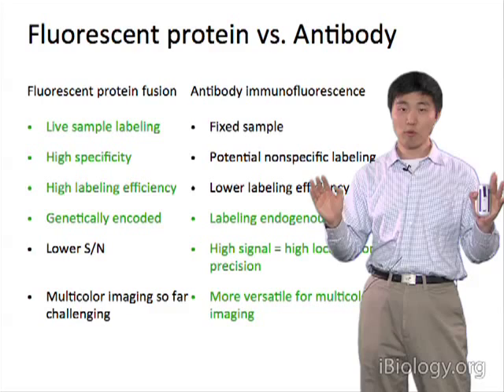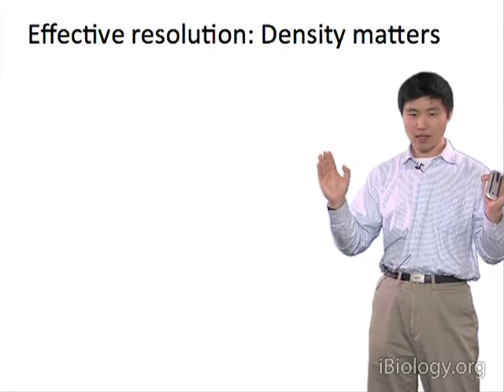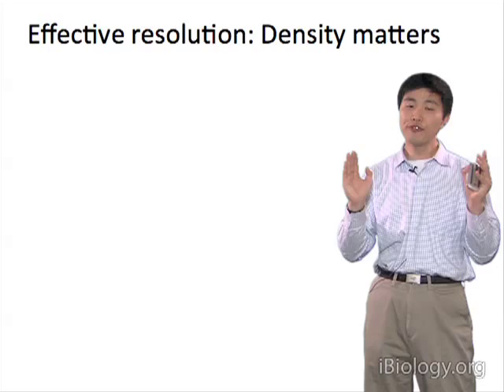Here we talked about one limitation of the effective resolution, the probe. There is another limitation. Here, we collected our microtubule images for a total of 40,000 frames. If I'm not using the entire 40,000 frame movie to reconstruct an image, we can have fewer points.